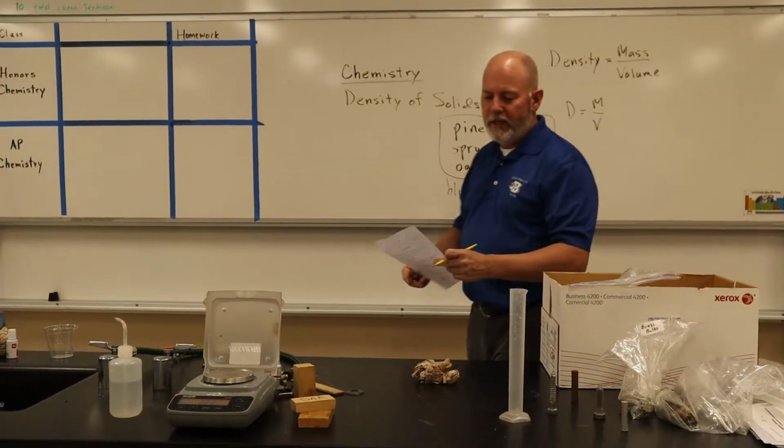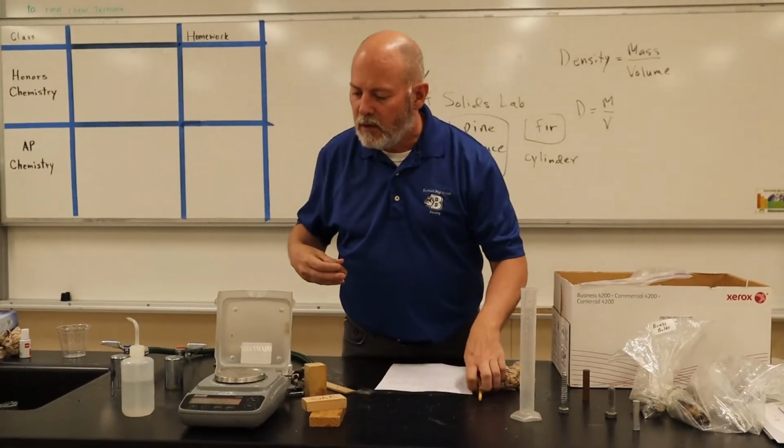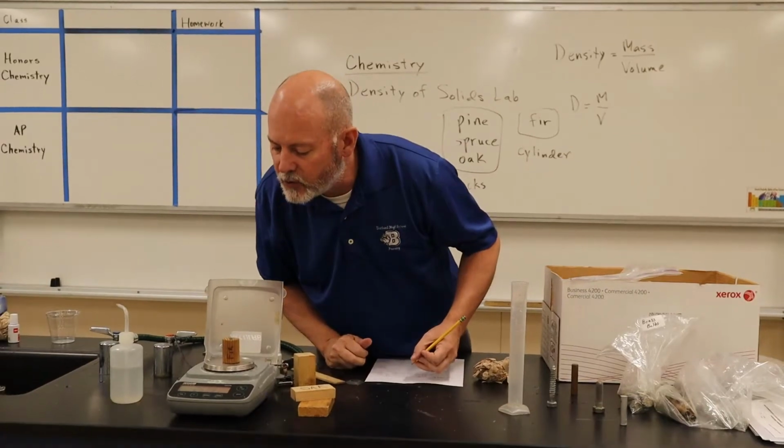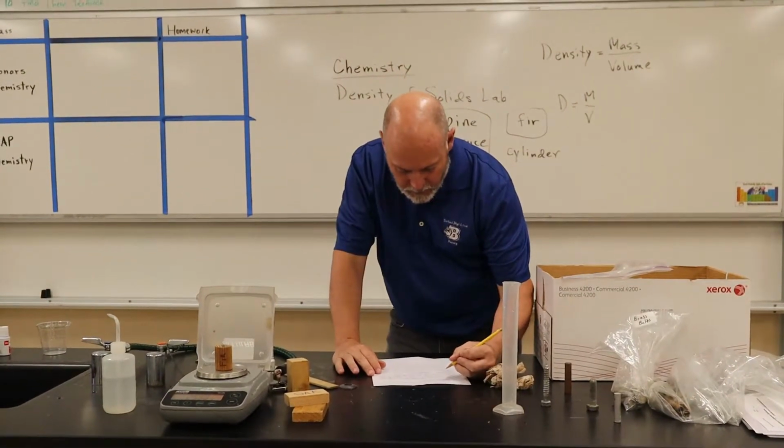So first, let's weigh them. Here we'll go with the fir first. We'll just weigh it. It's 25.79 grams.